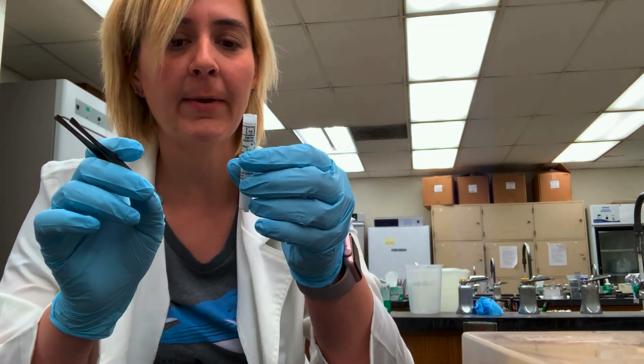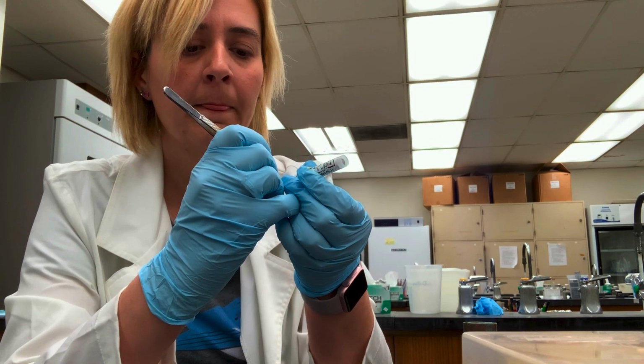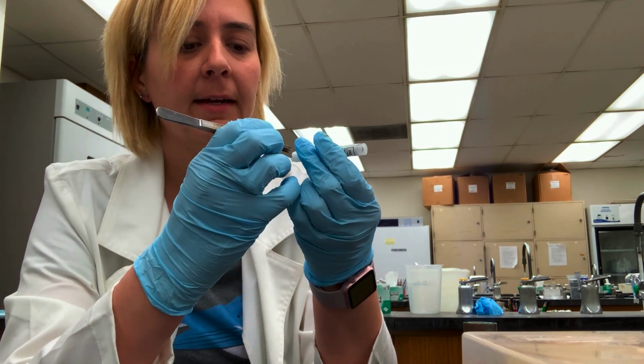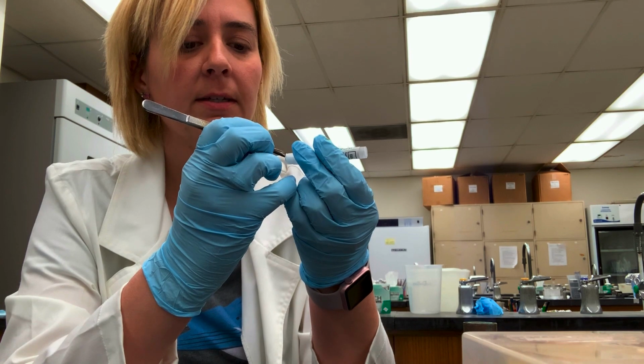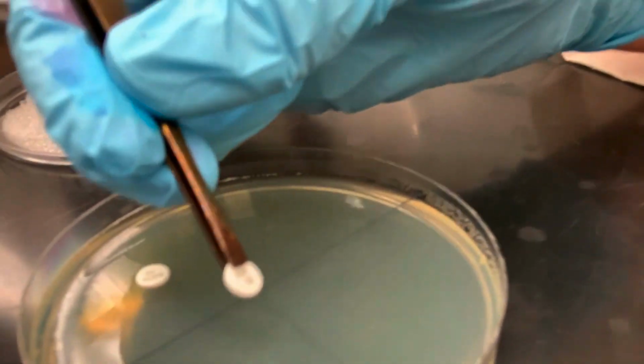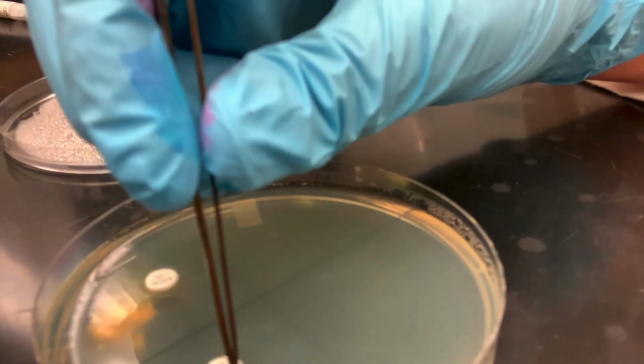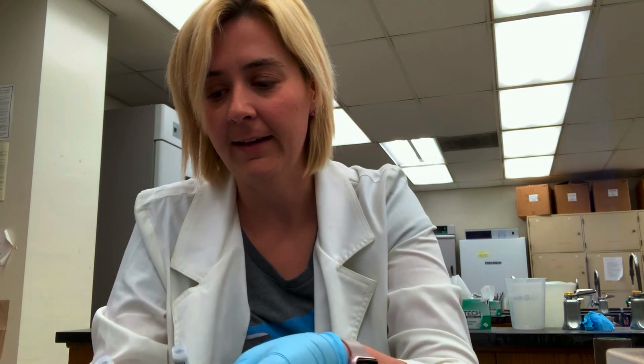I'll choose another antibiotic. This one is ampicillin. So again, I'm pushing the disc out. I've got my disc, and what you do is you place the disc on the plate and you push it gently down on there. So that's what I'm doing every time I put a disc on the plate. So I've done meropenem, I've done ampicillin.